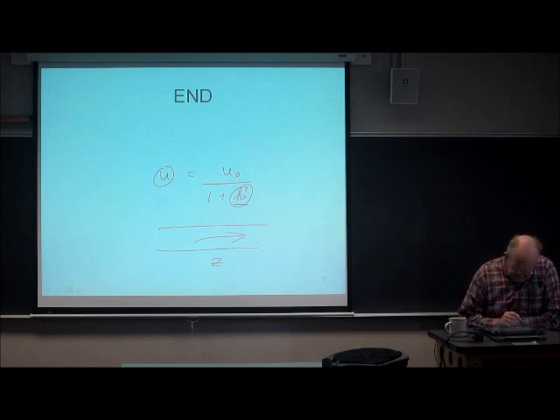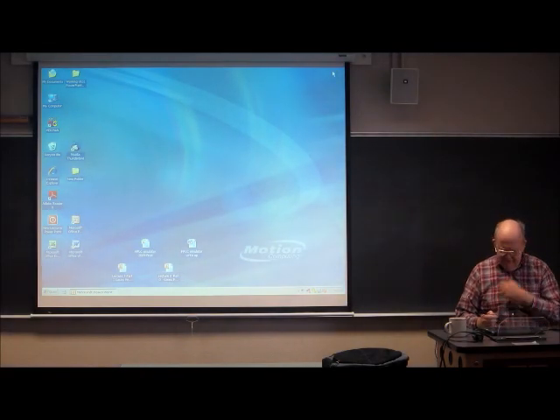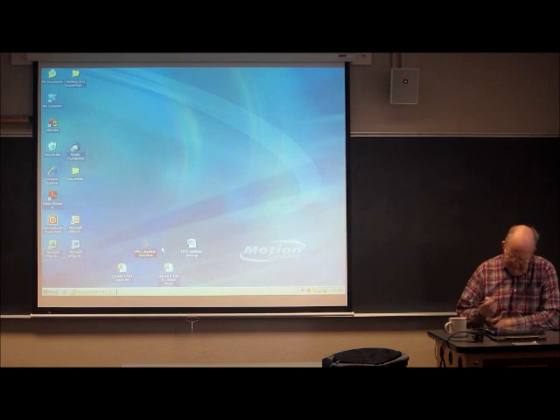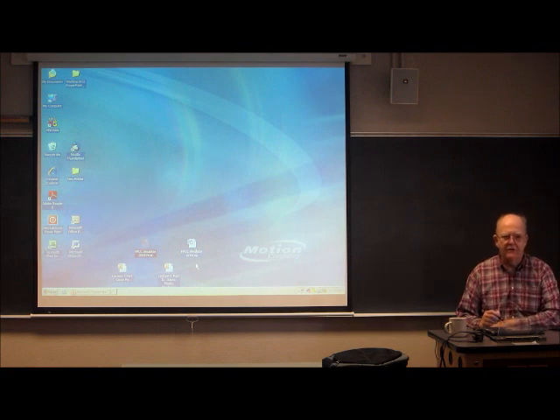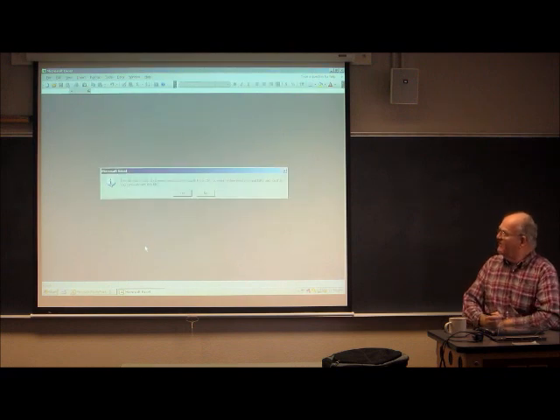Okay, now I did finish. I sent you yesterday an email, and attached to that email was this, can't write on it. I've sent you an Excel spreadsheet called HPLC Simulator, and I also sent you a Word file, which is a work that tells you what to do. Let me open up the Excel.